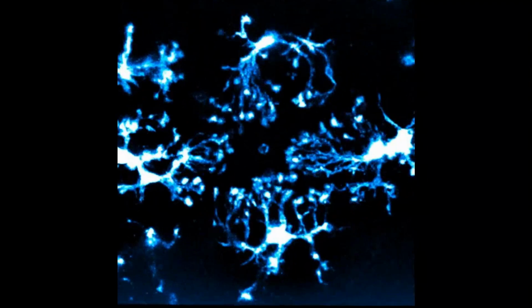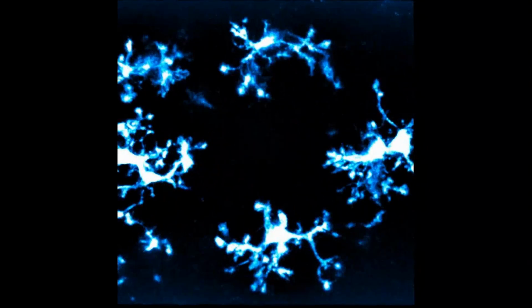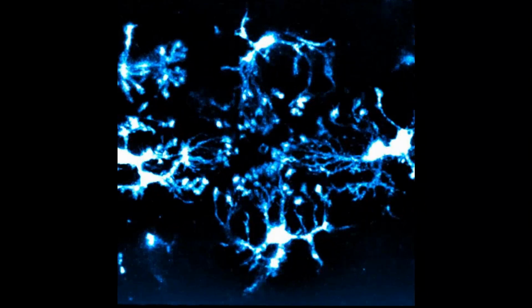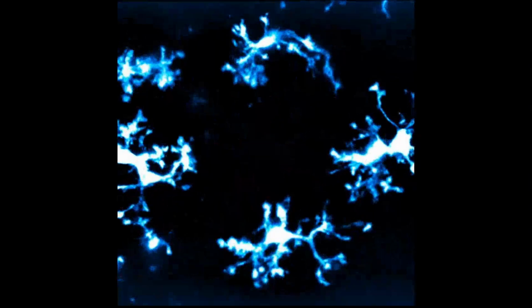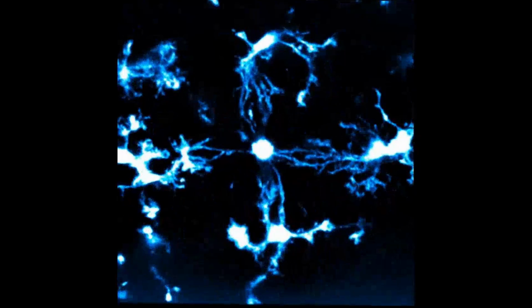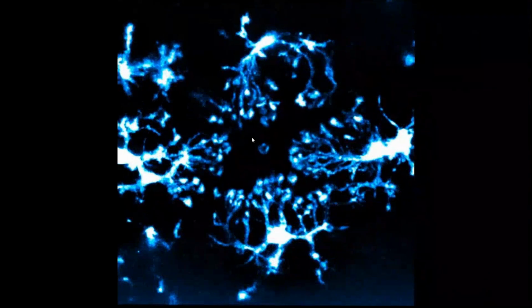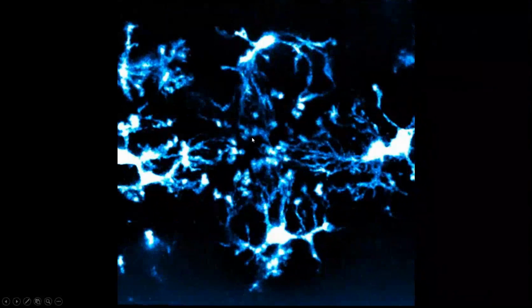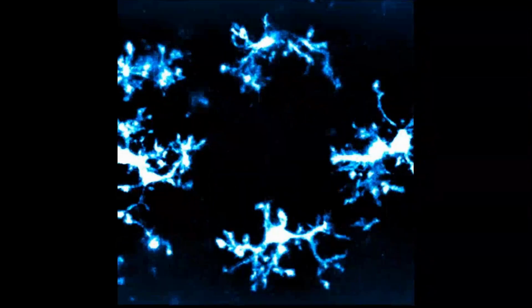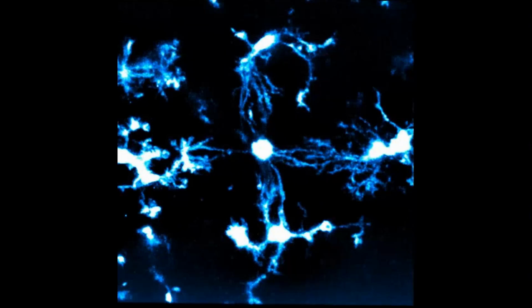So fluorescent microscopy. We use fluorescent microscopy because normally we want to see the brain in a live tissue. So when the tissue is alive, we can see the cells moving and the cells reacting to things. In this case, you can see the microglia, which are reacting to a laser lesion.